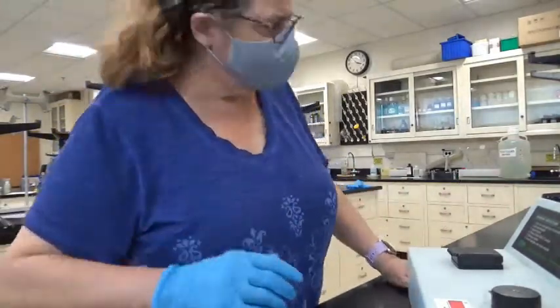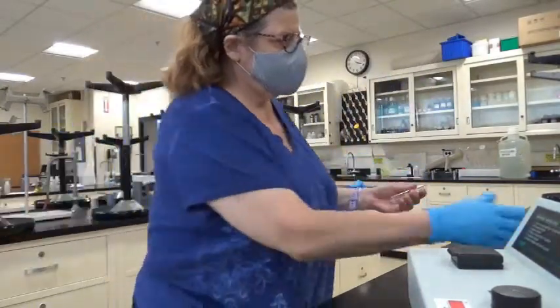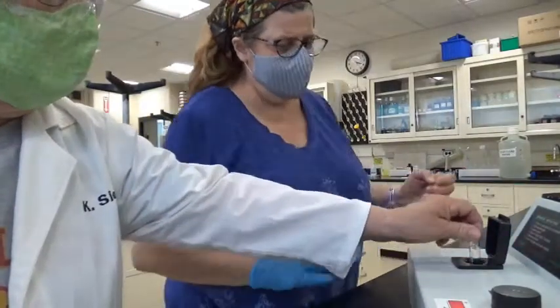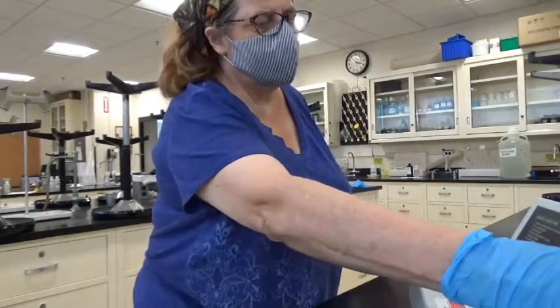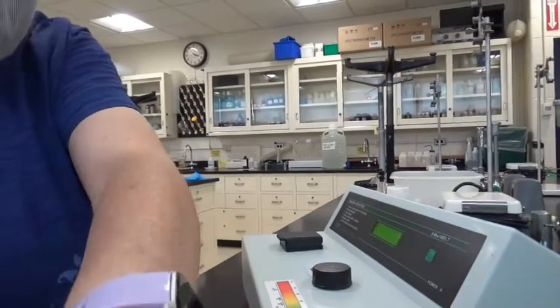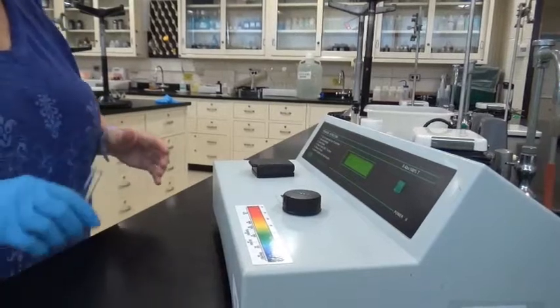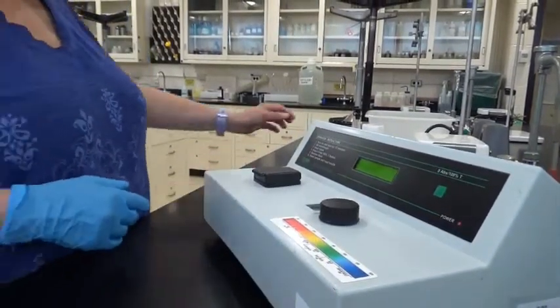So first, did we zero it? Let's zero it again, just to make sure. Okay, I think it's in here. So just leave it in there, and hit the zero. All right. Can it even see this thing? Now we use a wavelength of red to go through a blue solution, which is when it gets its maximum value of A.